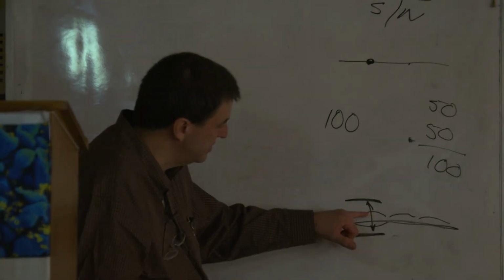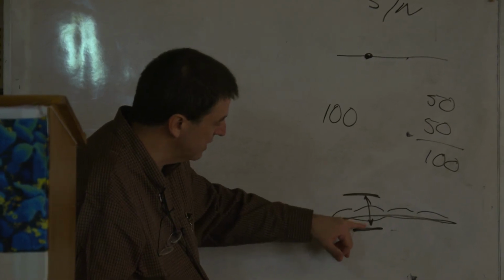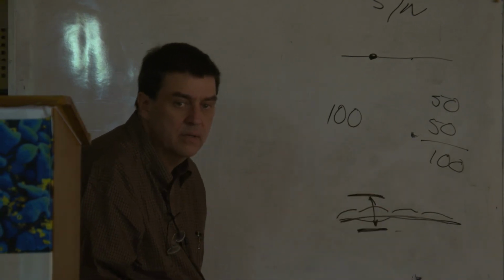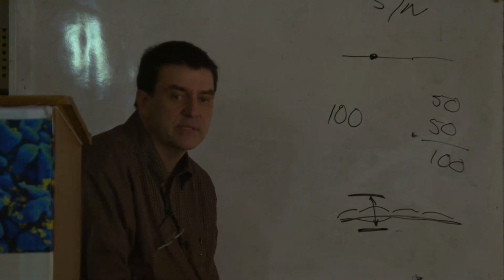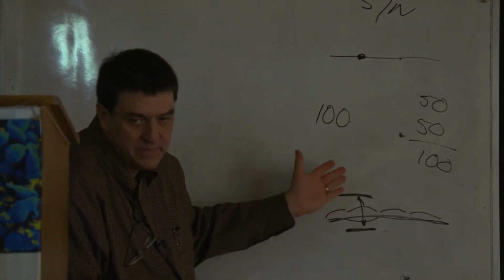Like I was saying, when you actually physically do it, you look to where it goes out of focus. So you know you're up above it, and then you go down below it out of focus. And then as you go across, take different pictures. If you do that with every cell, you'll get the whole cell each time. That's how we go about it, to try to capture the same thing every time. Because a little bit of overkill is okay. So you get a little bit of dead space here, a little dead space here. That's fine.